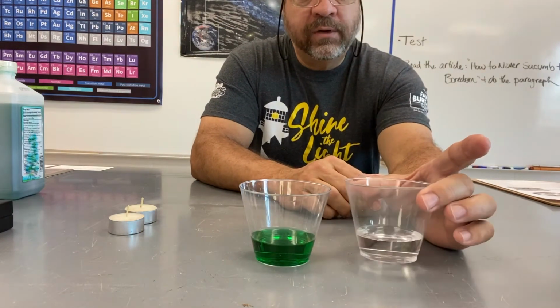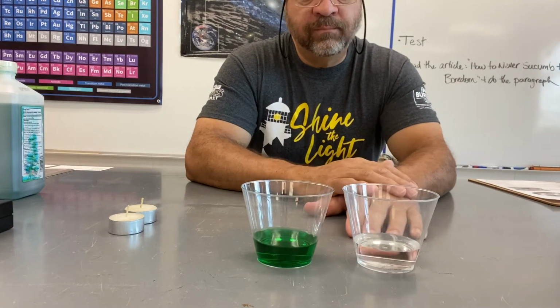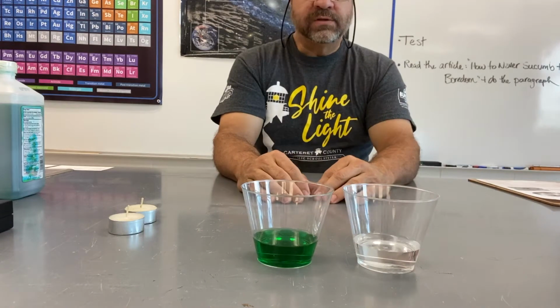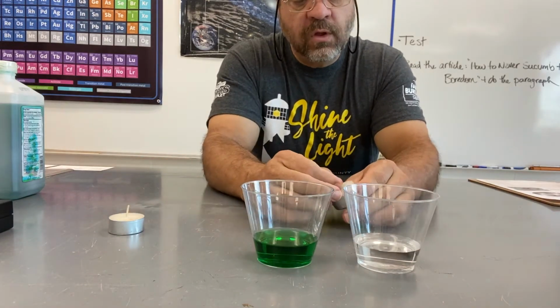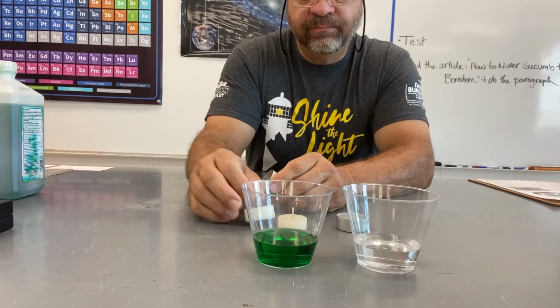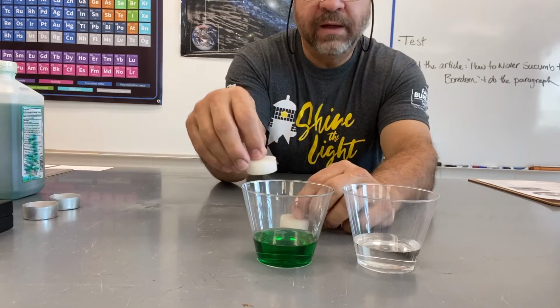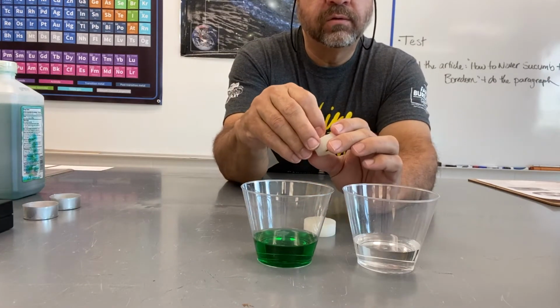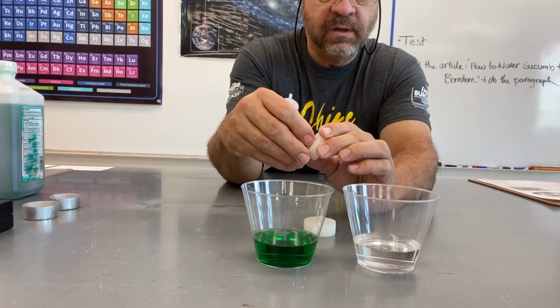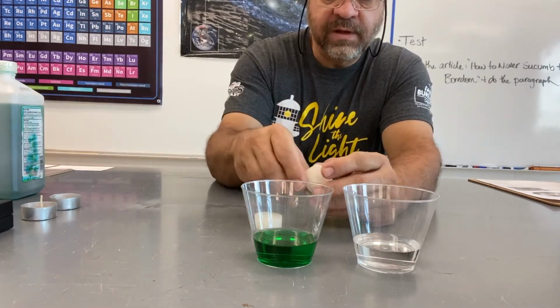All right, so I've got water here, that's a clear one. I have rubbing alcohol here, that is the green one. All right, now what we're gonna do is see if a candle will float on the surface of both of them. So I've taken the candles out of their little aluminum cups. I'm popping the wicks out so that that's not a factor.